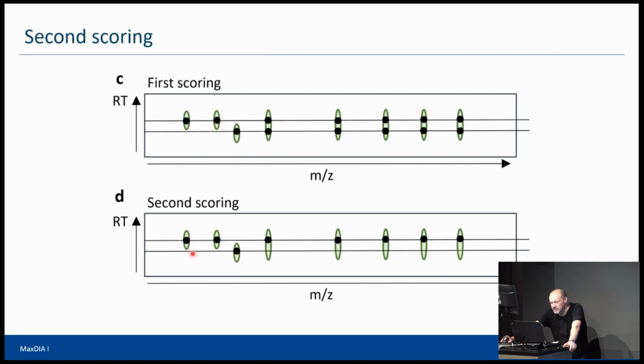So that way, almost all of the fragments would go to the upper library spectrum, and the other one would get only one of the fragments. And basically after FDR control, it would probably be gone, right? Because matching just one fragment is very likely not enough to survive the FDR control later. So with that, we make sure that we don't overinterpret your data.